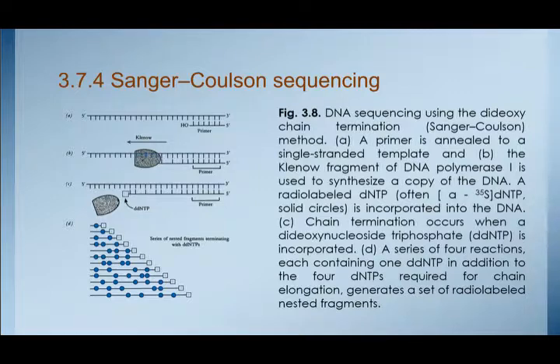The DNA chain is labeled by including a radioactive dNTP in the reaction mixture. This is usually sulfur-35 dATP, which enables more sequence to be read from a single gel than the phosphorus-32 labeled dNTPs that were used previously.